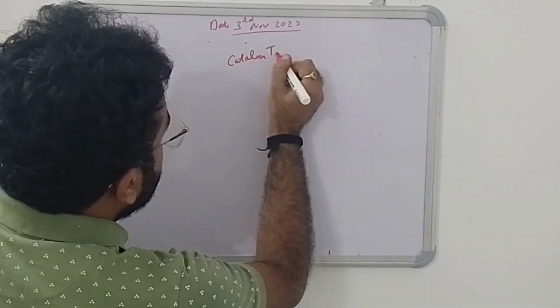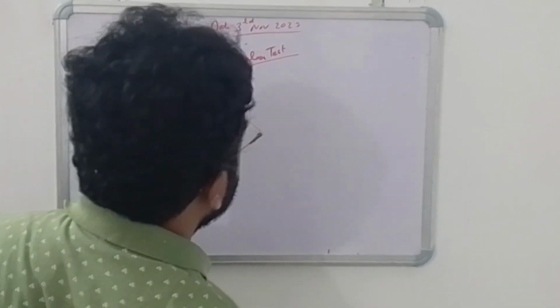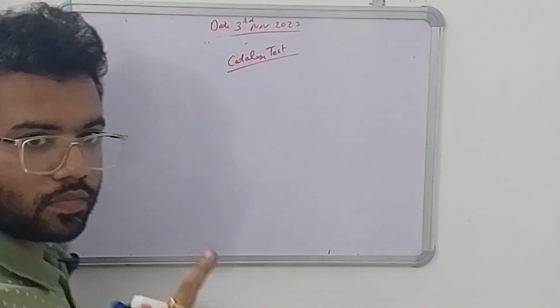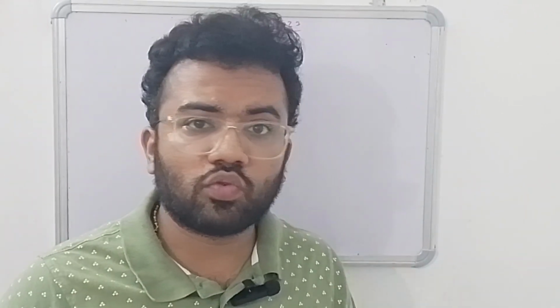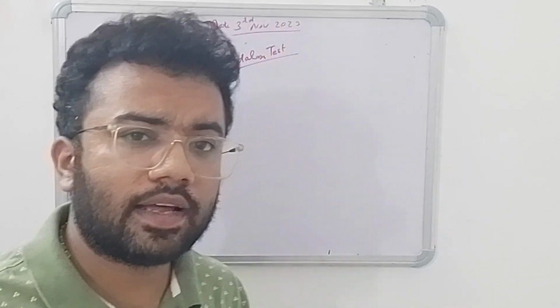Catalase test. So what is the catalase test? Just remember that staphylococcus has the catalase enzyme, while streptococci doesn't have the catalase enzyme.